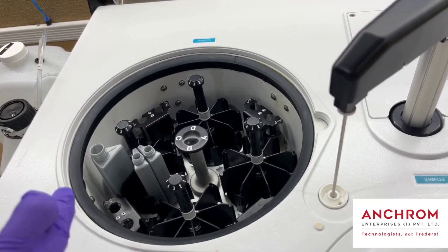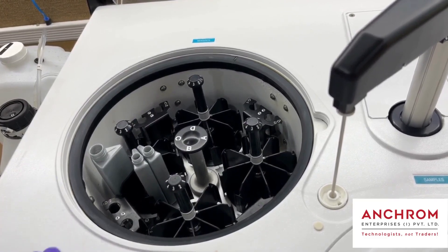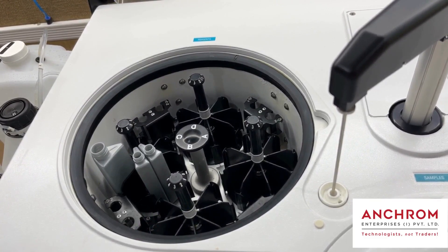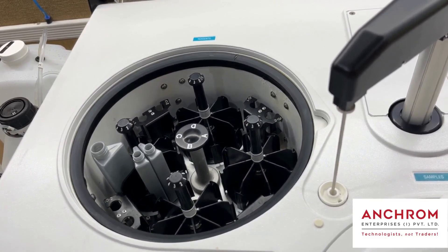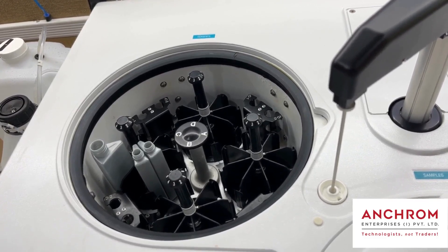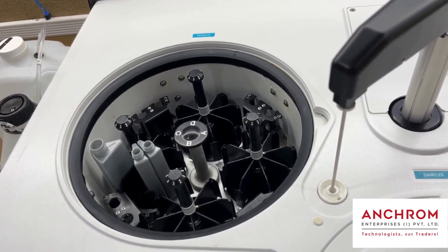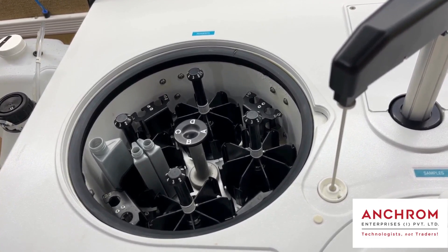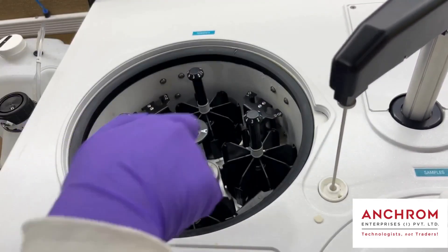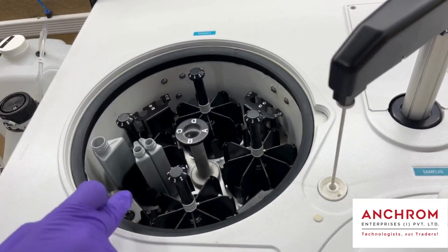If you are using 50 ml reagent bottles, you can store 36 reagents at a time. We also offer a full range of enzymatic and colorimetric reagents dedicated to our SmartChem discrete analyzers. You can also store your QC or reaction-related sensitive chemicals here, because this chamber is refrigerated at 4 degrees Celsius.